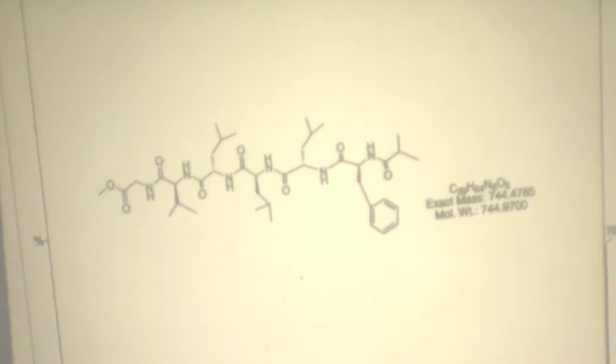All right, so this, and we're going to be talking more about actual mass spectra in subsequent times. Everyone have a handout? All right, so this is a handout of a particular molecule. This one happens to be an example of a peptide. Now we're going to talk more next time, but one of the big concepts is you're separating molecule by molecule, which means you're looking at individual isotopomers.